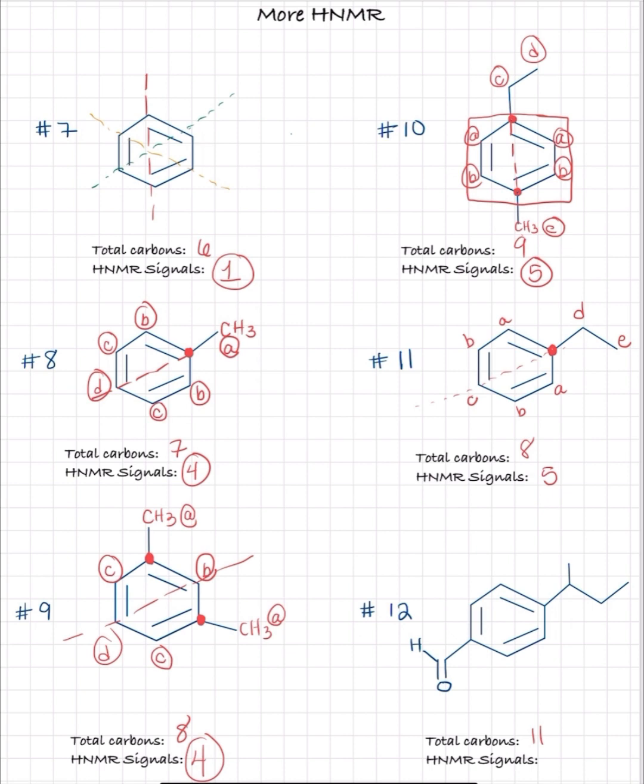So remember, you need to start off with carbons that have hydrogens. Some students, I'll tell you, if it makes it easier for you to see, look for the carbons that are complete in the octet rule or have 4 bonds and immediately knock that out. So this carbon has 4 bonds.